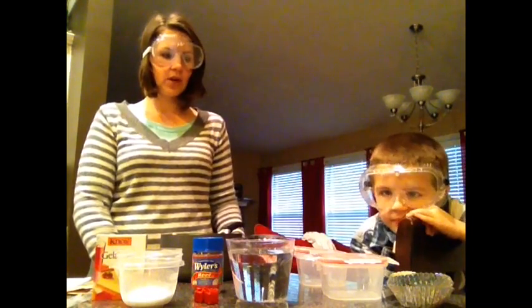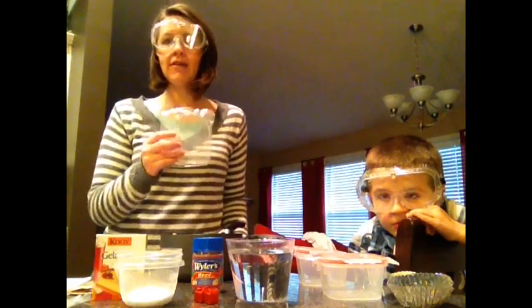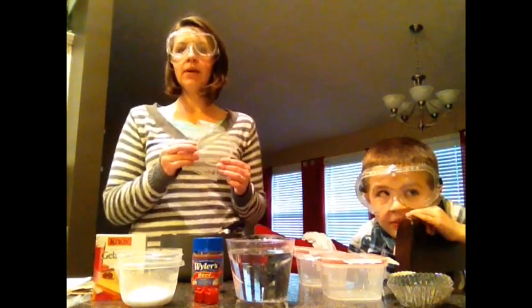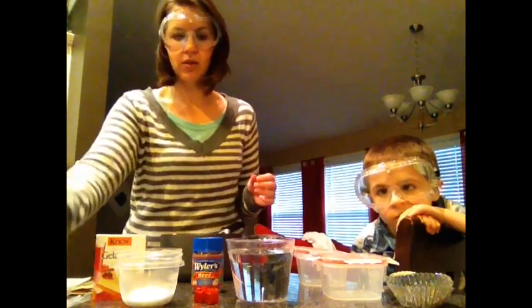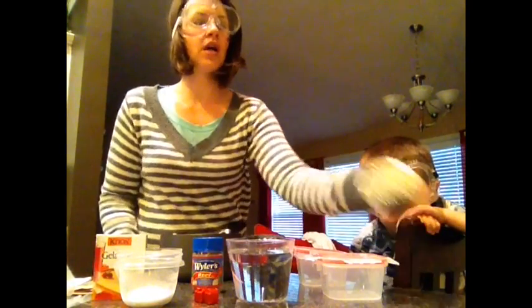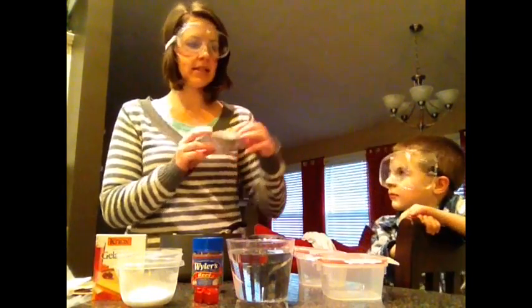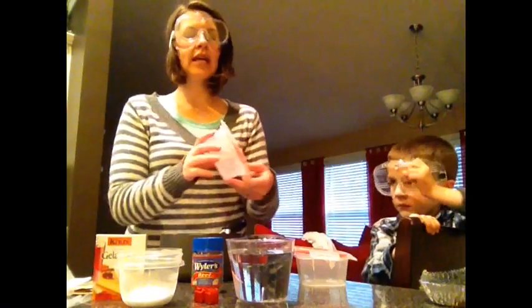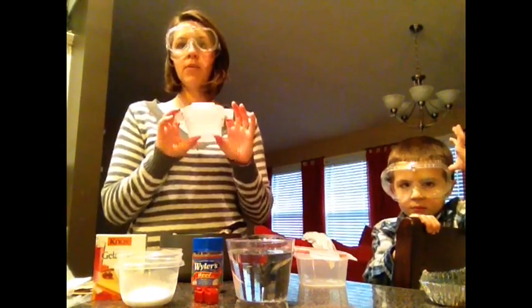Here are the things that you are going to need. You're going to need petri dishes. If you're in life science, you may still have some petri dishes you can use. If you don't have petri dishes, there are some substitutes you can use. You can use aluminum cupcake holders — those will work nicely — or you can use any kind of Tupperware that you can do an airtight seal on.